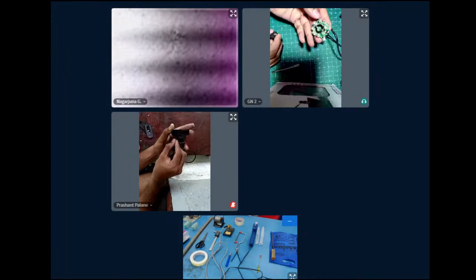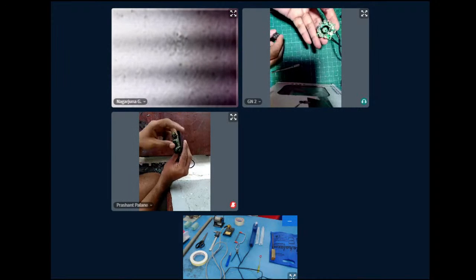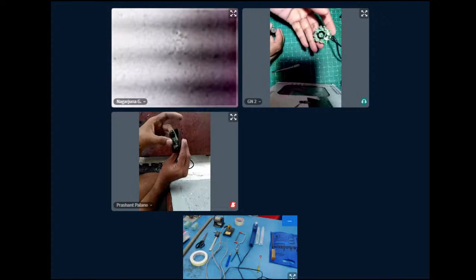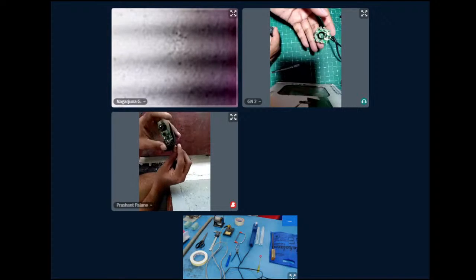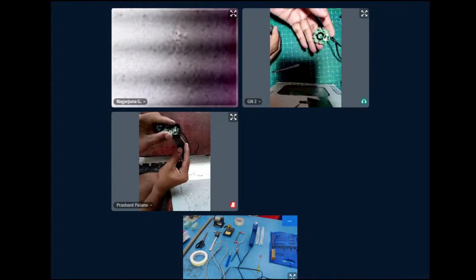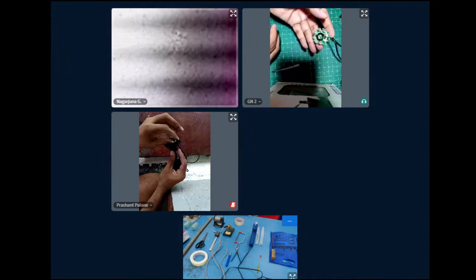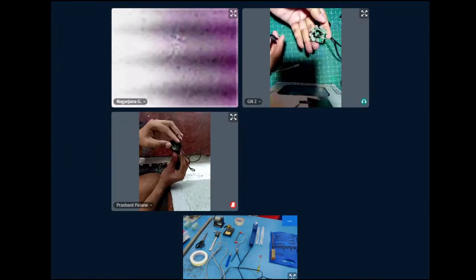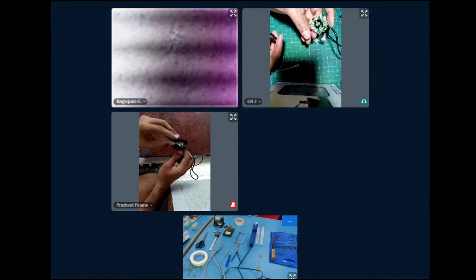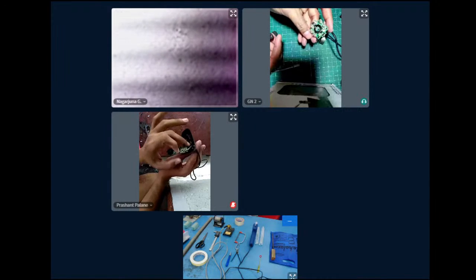Now, if you have a laptop, you should connect and see whether it is giving you the signal, because that is very important. You don't want to destroy or damage the circuit, because we are not doing an electronics experiment here. This is basically inverting the lens, nothing more than that.